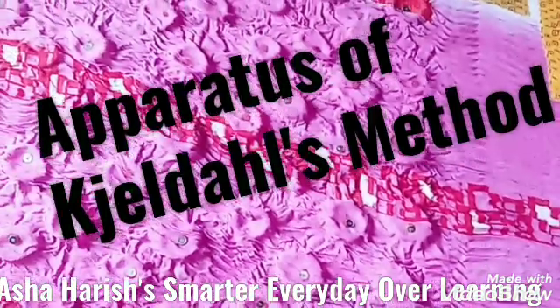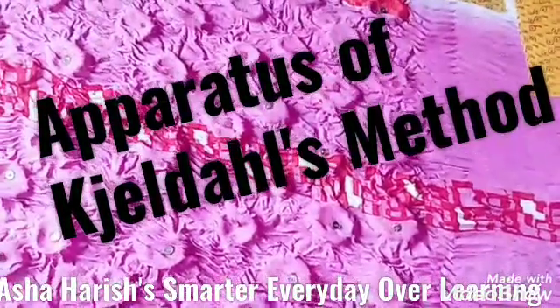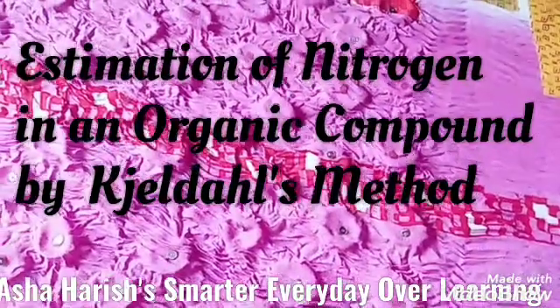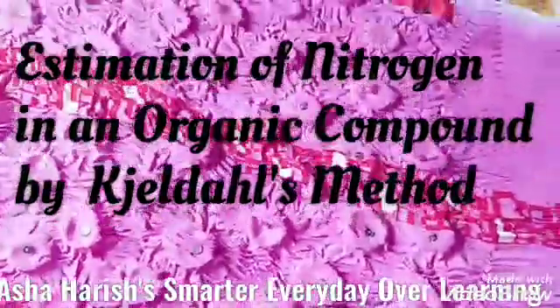Okay students, this is completely the information about the Kjeldahl method, the animated activity part. Right, I hope you have understood and I hope you like this class. Okay students, thank you so much. This is about the estimation of nitrogen of an organic compound, based upon quantitative analysis.